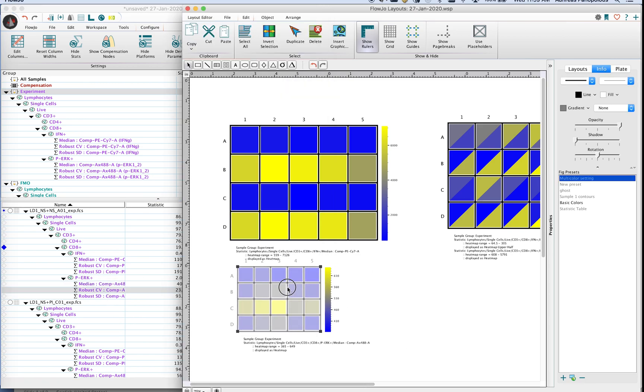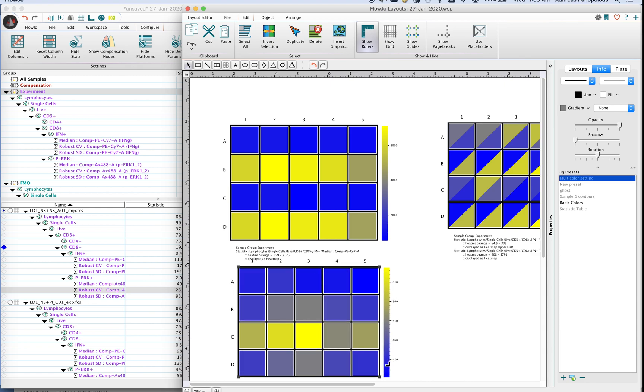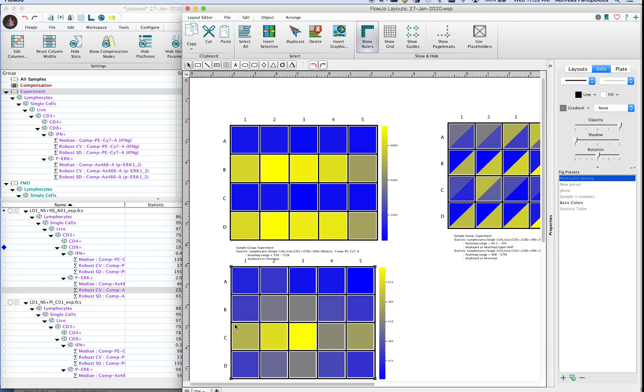You can clearly see in this case that my phosphoerk stimulation, the high point is around the 20 minute and then after an hour or two hours the signal dampens. So in my opinion it's a little bit easier to visualize statistic by statistic using a single plate for each of those stats.